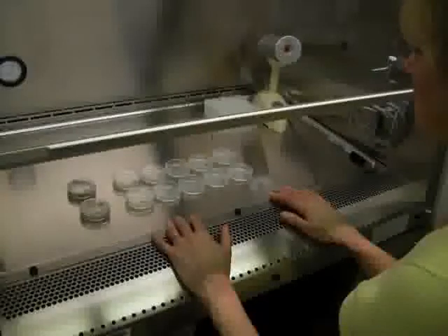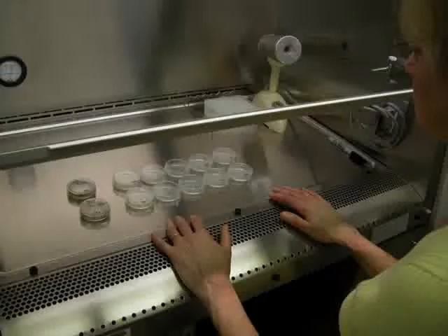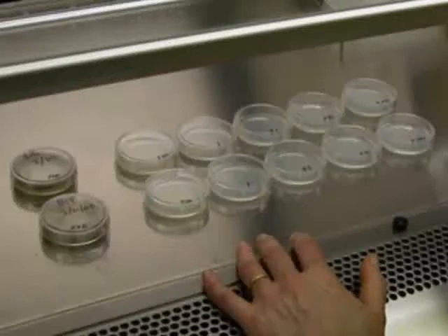Now, there are written details for both parts of the experiment in the Lab Report Resources folder of Angel. In part 1, we will use agar with no fungicide and agar with fenhexamide fungicide at concentrations of 0.002, 0.02, 0.2, and 2 micrograms of fenhexamide per milliliter of agar. And micrograms per mil is the same as parts per million, or ppm.